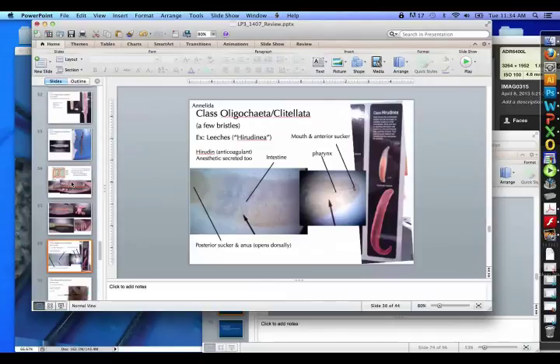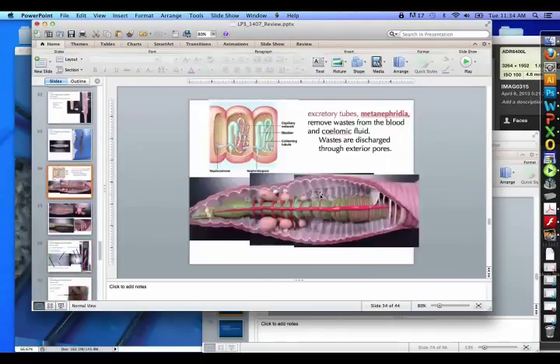Oh, nephridia. So the only other thing I wanted to show, it's really hard to see in the real organism, but these blue, 2 little nephridia in each, or metanephridia, excuse me, metanephridia. So the metanephridia are the excretory system, so the metabolic waste, meaning nitrogenous waste, like our urine kind of waste. So the solid waste goes through the digestive tract. This is going to be for processing liquid waste. And you can see that they're coiled, actually look a lot like our kidney.